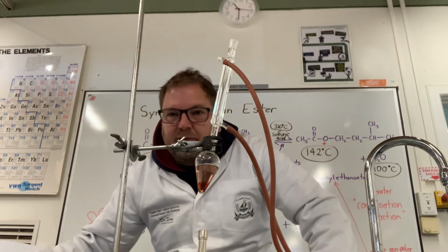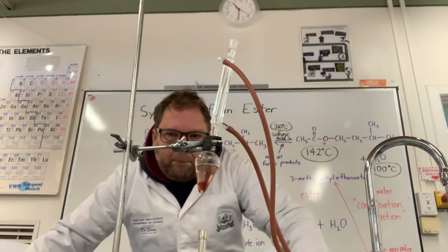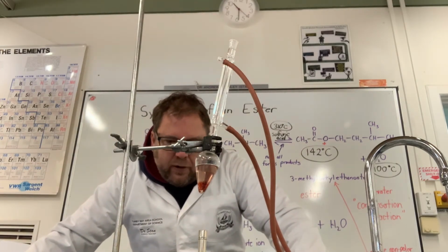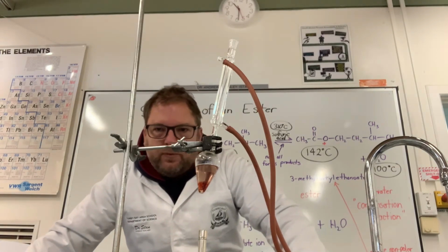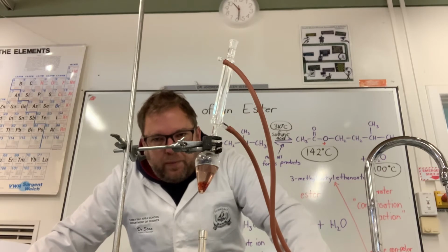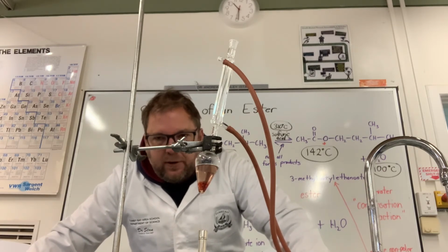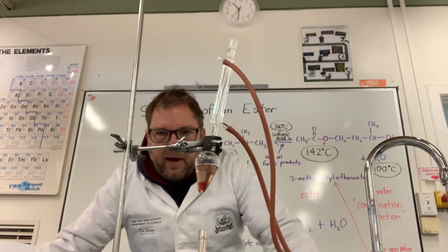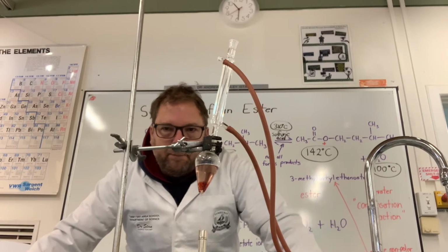Just take this face mask off. One of those will be the polar layer, the water-based layer, from the water that's formed in the reaction. The other will be the non-polar layer. I'll show you in a sec how we distinguish between the two. But just going to leave that sit tight for a couple of minutes and let it all cool down.